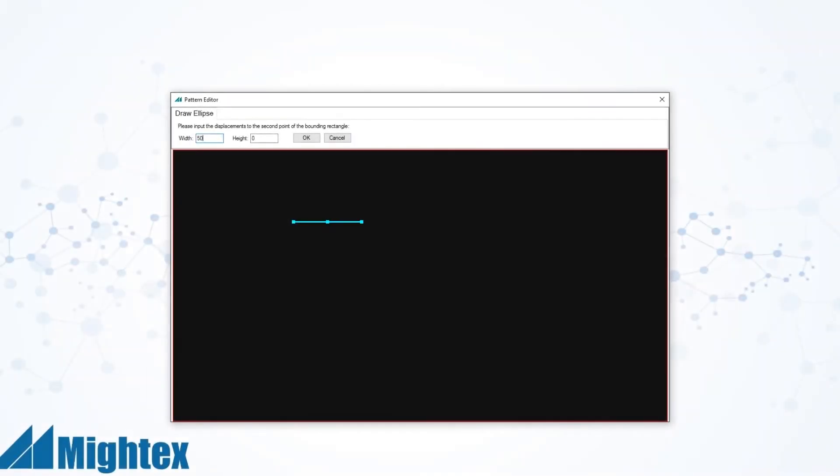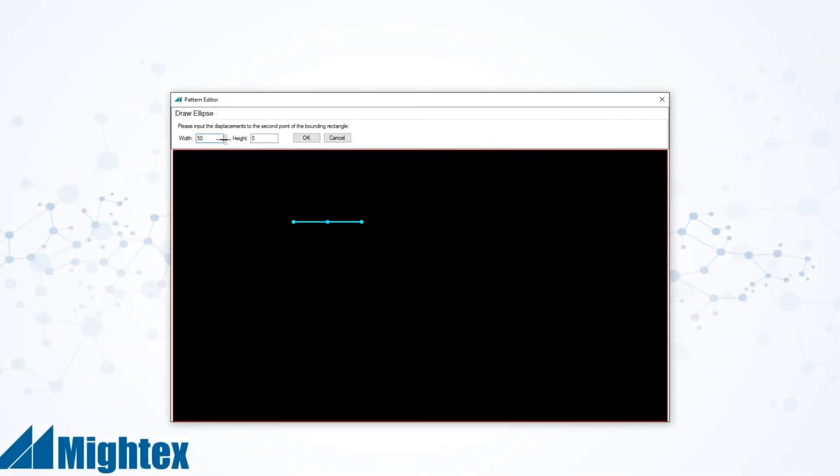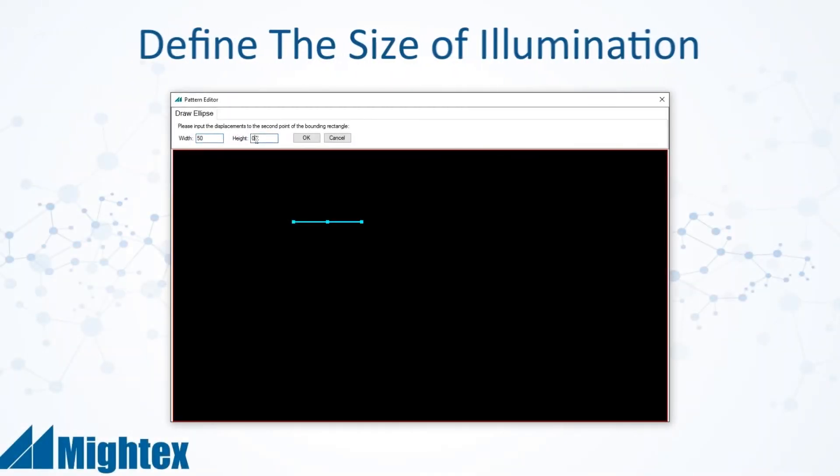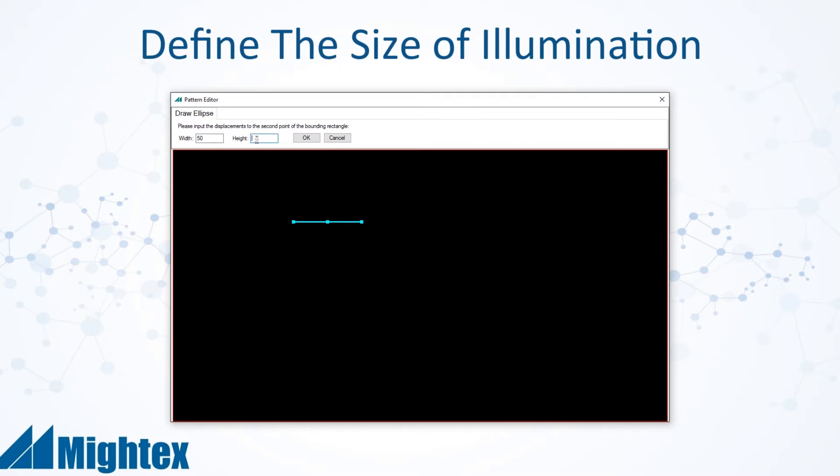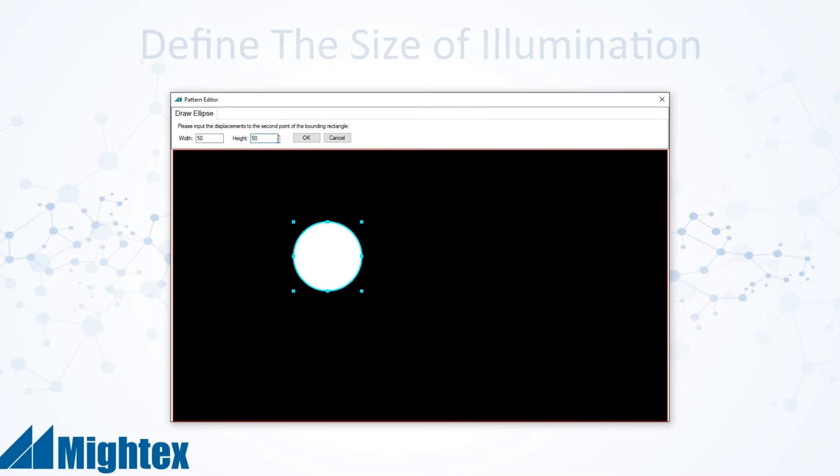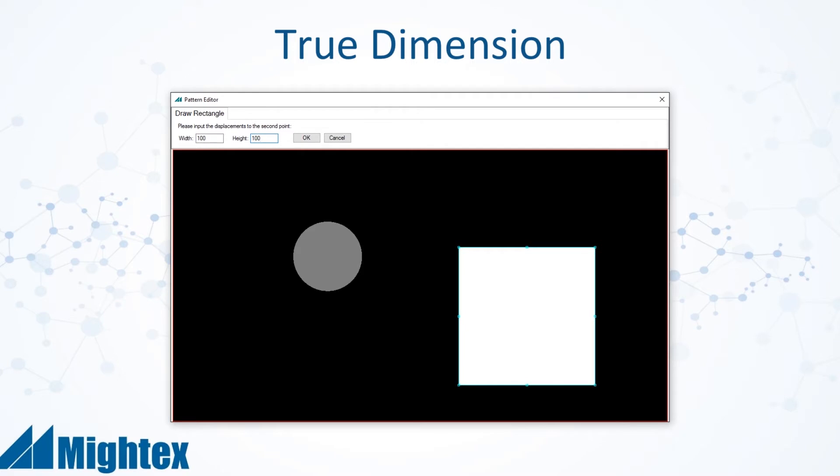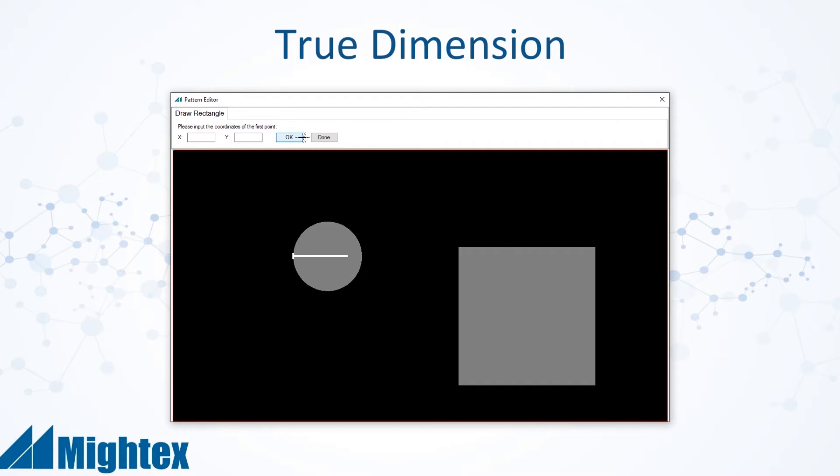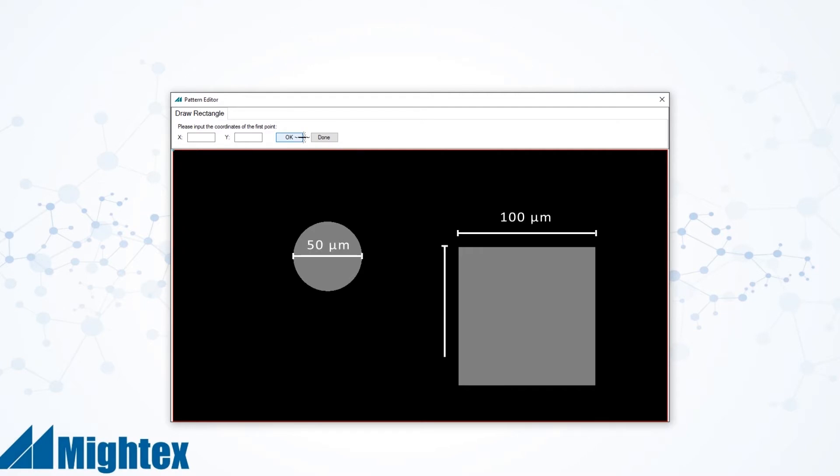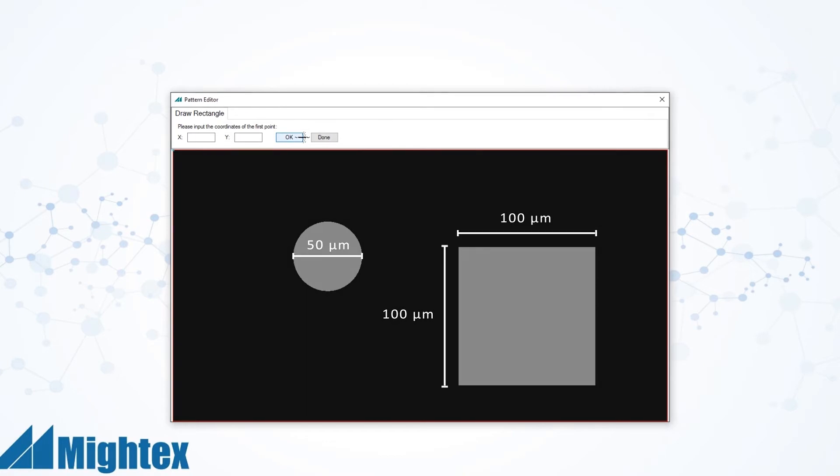Some experiments require setting a defined size or area of illumination. PolyScan adds true dimension, a unique feature that allows you to specify in units of micrometers the size of the illumination pattern, such as a 50 micron circle or a 100 micron by 100 micron square, just to name a few examples.